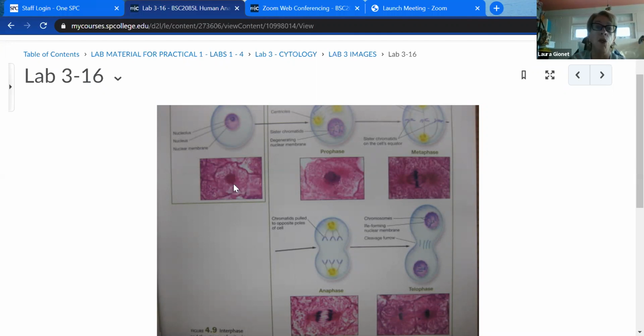However, when it comes to the nucleus, you can often see a nuclear membrane intact, and the chromosomes are not as visible as they are in prophase. Why? Because they're all relaxed and you're copying them all. So generally, you don't see it really darkened that much, but you do see a membrane. And if we could magnify that, you'd be able to do that.